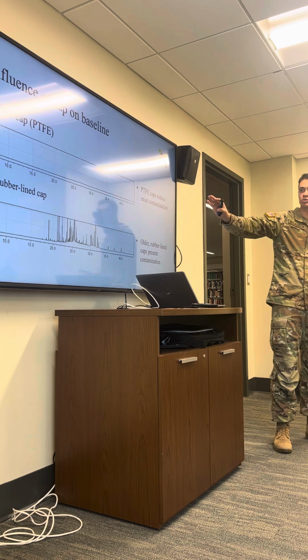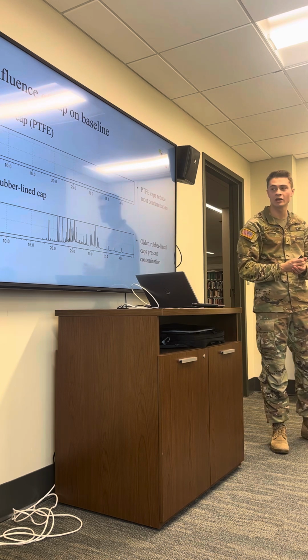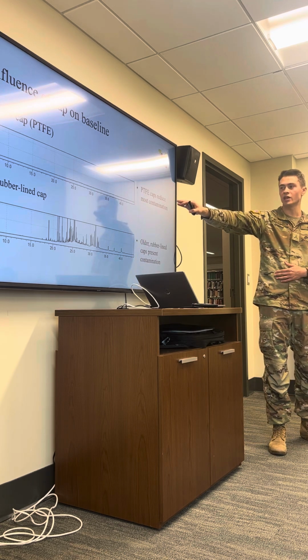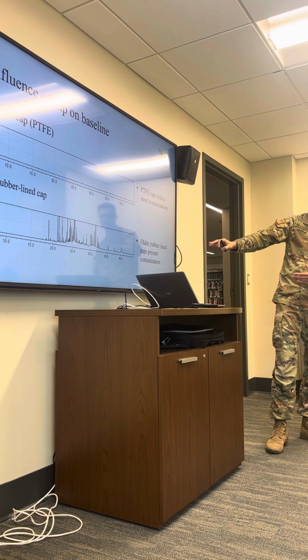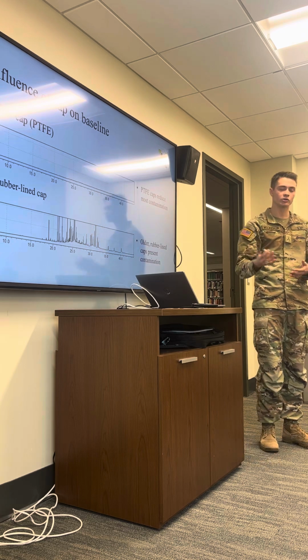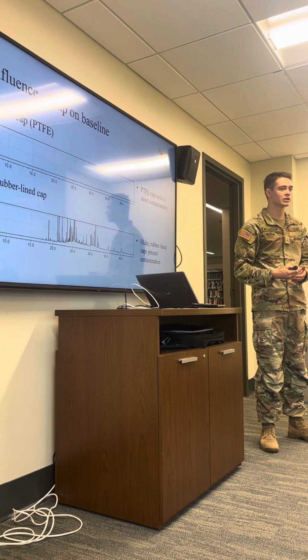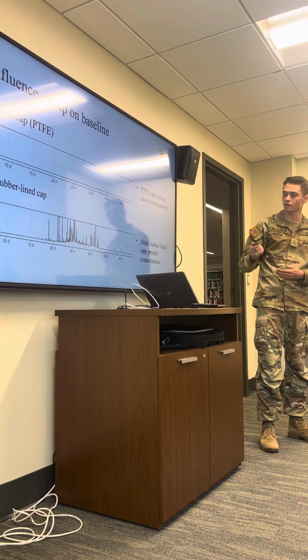The next is the caps. Two caps were used: a newer cap using a PTFE lining, or polytetrafluoroethylene, and then a rubber lined cap. The PTFE caps reduce most contamination to below detectable limits, whereas the rubber lined caps present contamination within our FAME region, which exists between the 20 to 35 range, meaning that whenever we're trying to identify fatty acid methyl esters from pottery, it can lead to false positives or it can invalidate the integrity of certain experiments.